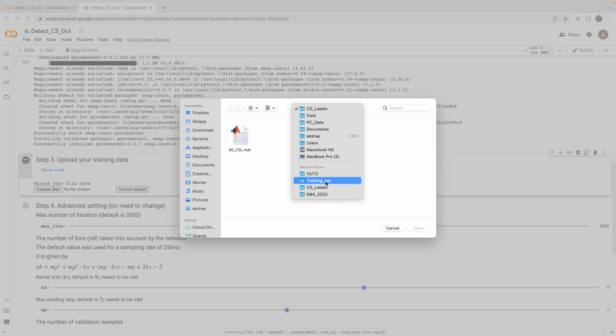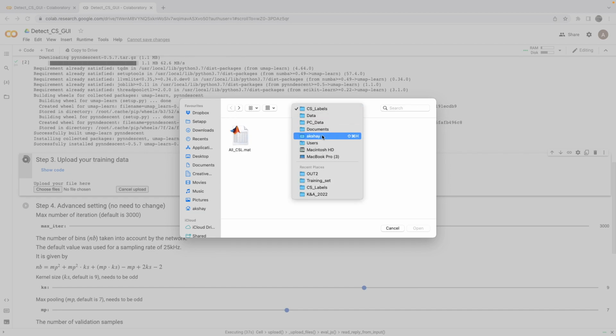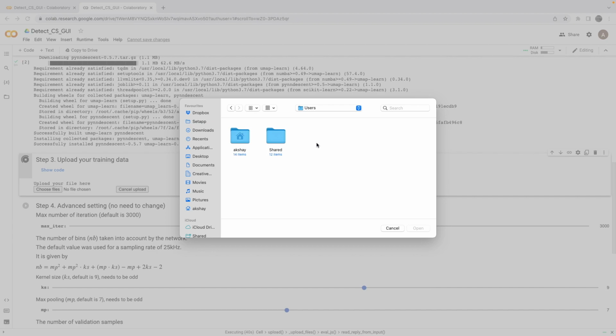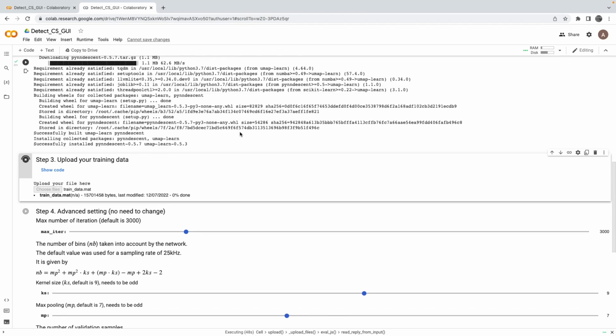So the training set is here. Let me just remember where it was. I think I copied it in the folder, and I need to find where it is now. Let's go back. All right. There you go. And training data. And I basically just upload this. This should not take that long.